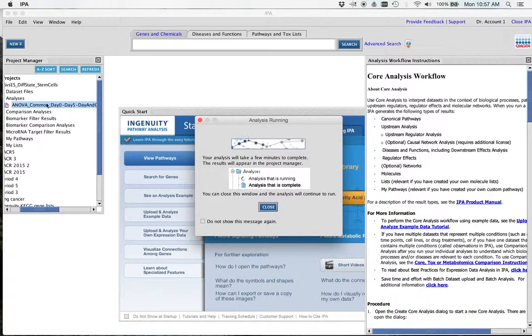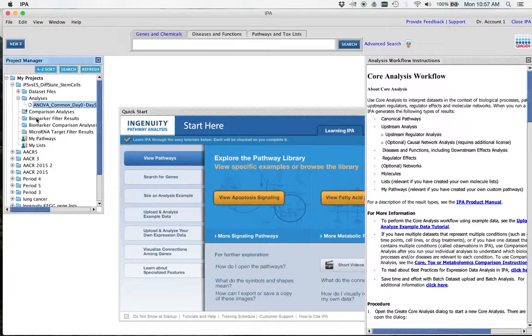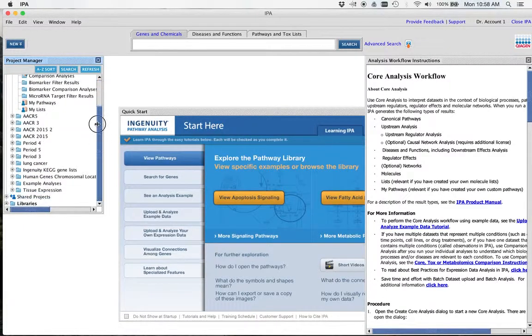All right, so what you'll see is your list will show up in this menu bar here. And what'll happen, spinning wheel of death. Basically what we're doing is we sent our gene list to a supercomputer in Silicon Valley, California. And it's using its database to tie all the biological information contained in that data set that's associated with our genes to our list and then send it back to us. So this does take a little while. But again, please do this for all your gene lists.